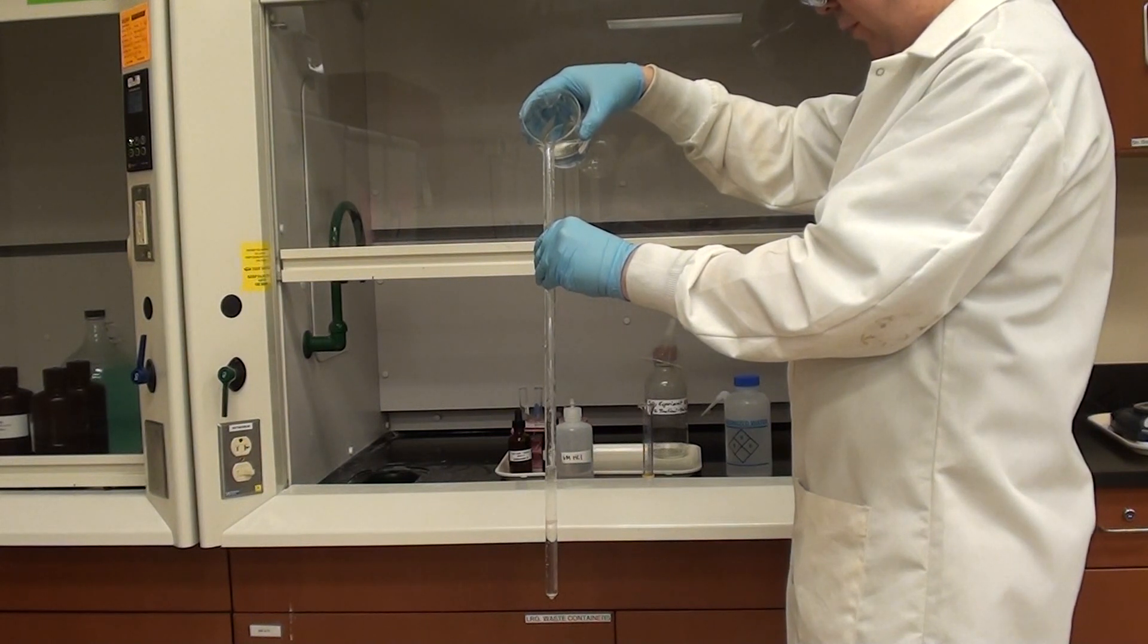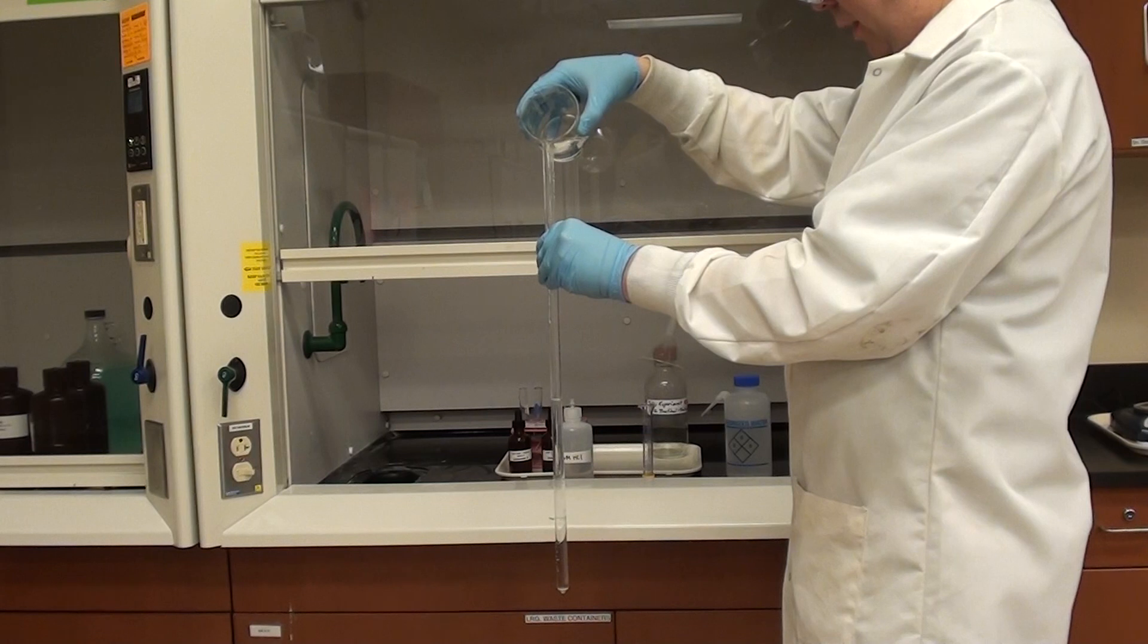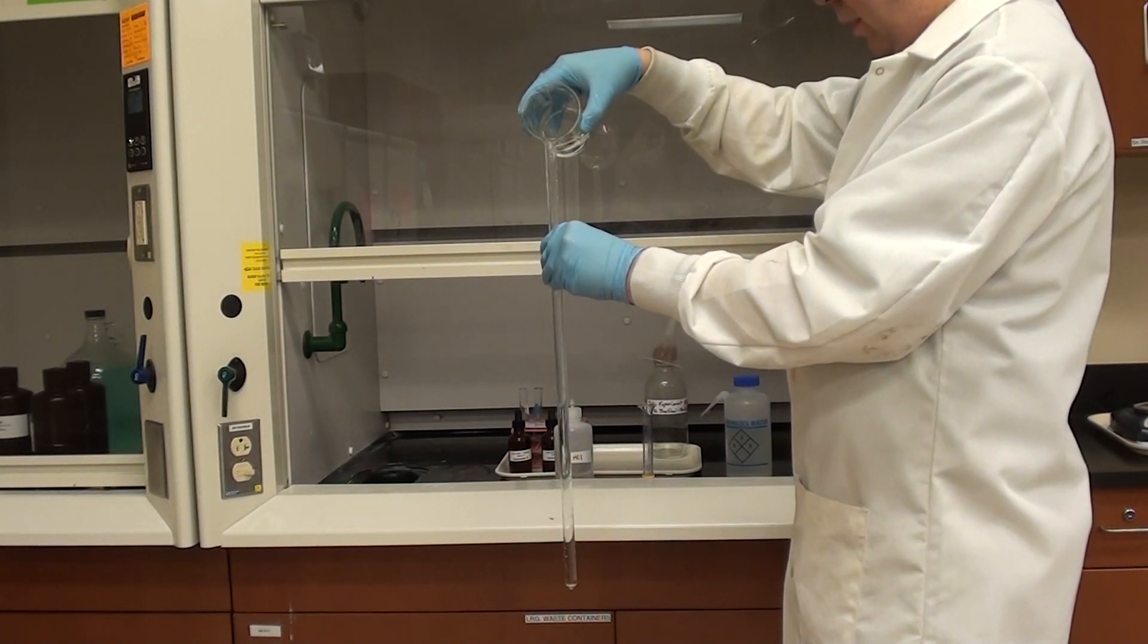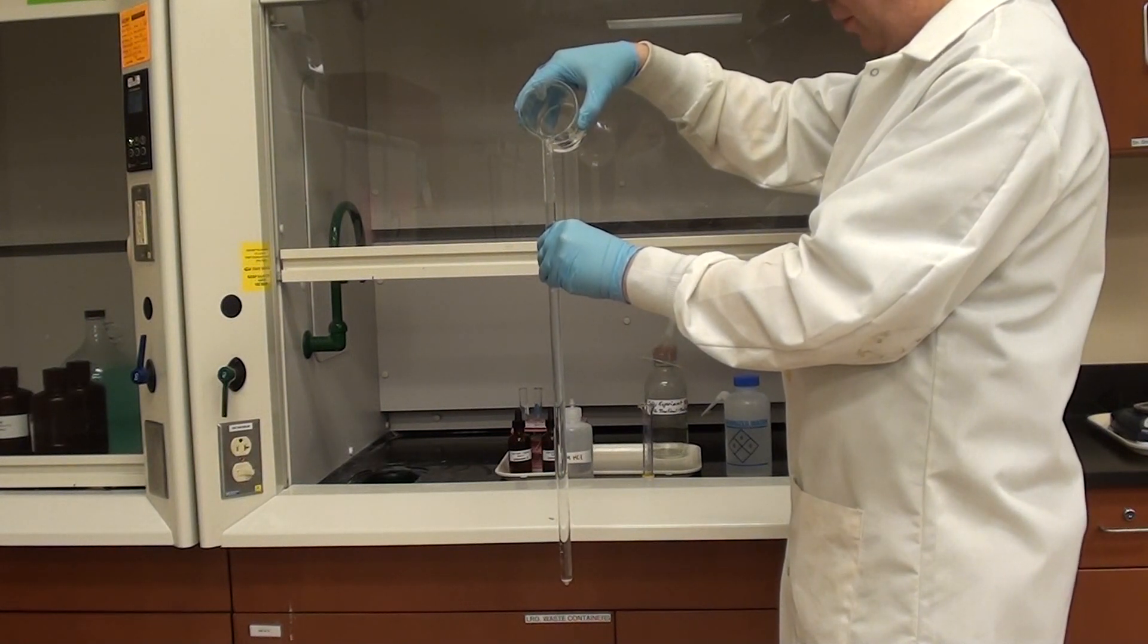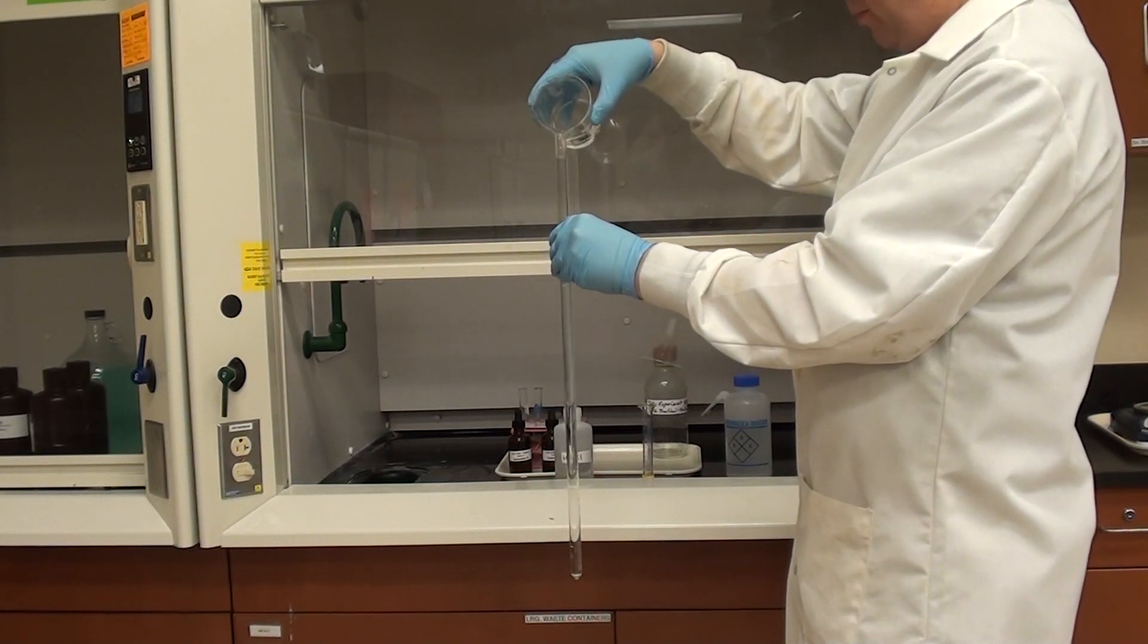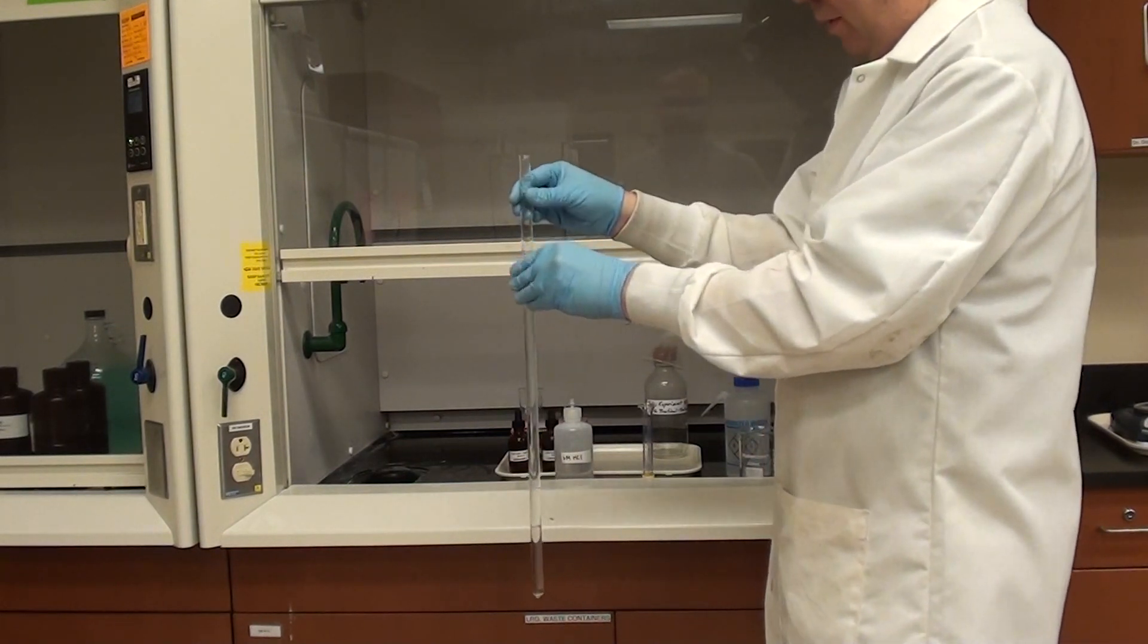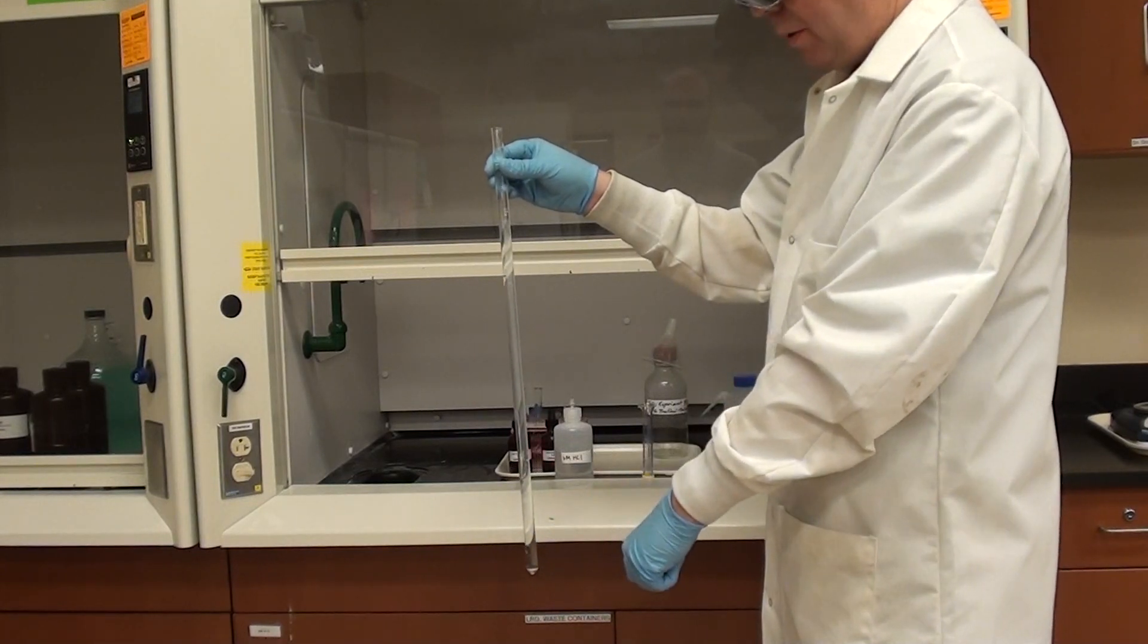Just do it fairly slowly at first and then we can fill it a bit faster as we go closer to the top. And you want to probably fill it maybe about an inch from the top, something like that. That'll be fine. We're going to put a stopper in there so we need a little bit of space there. We've got this and then we've got the HCl still on the bottom.